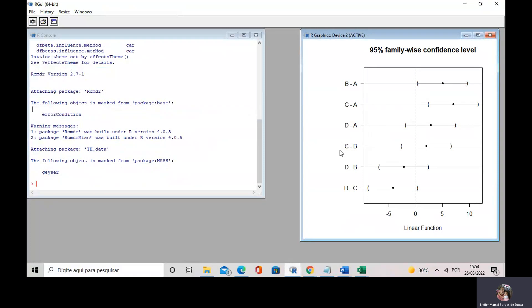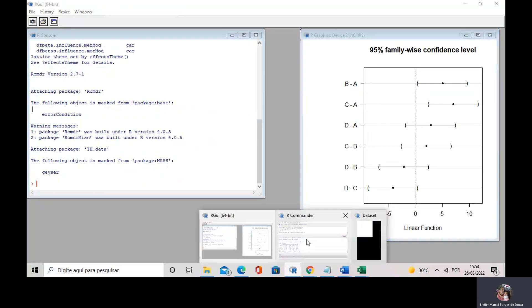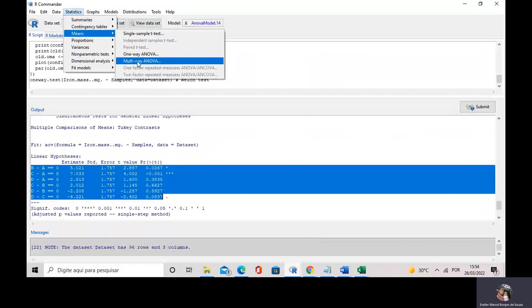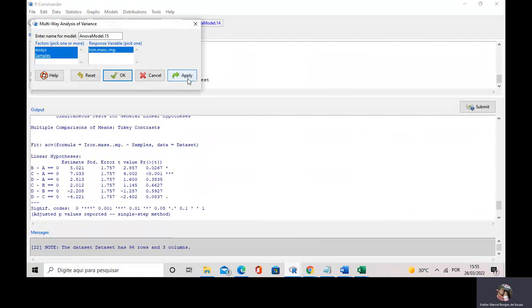How can I do a two-way ANOVA using Commander? I go to Commander, I go to Statistics, Means, and then Multi-Way ANOVA. You might think that in some situations you could have more than two factor groups — you can do any number of factor groups you want in Commander. Now we have just two factors, that is the assay and samples. My response variable is the iron mass. I select both and then go to Apply.